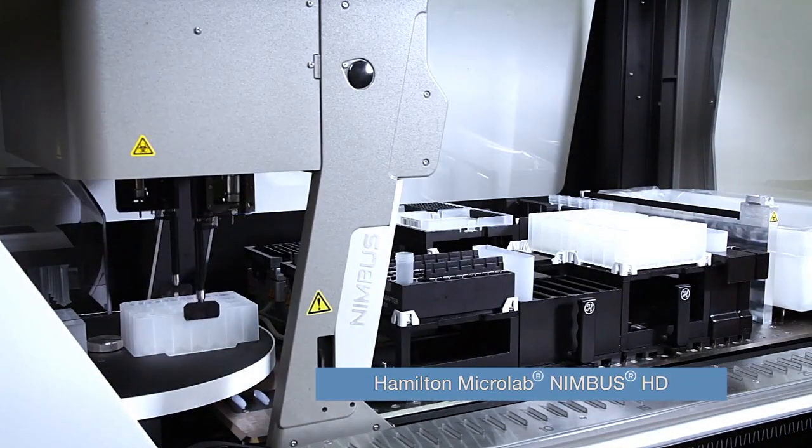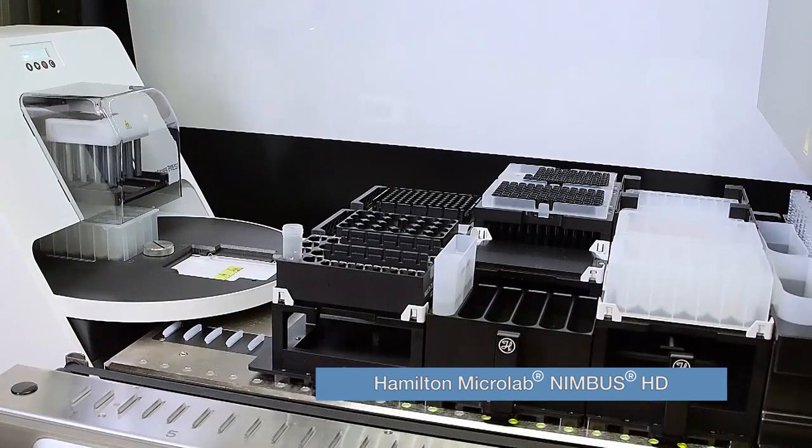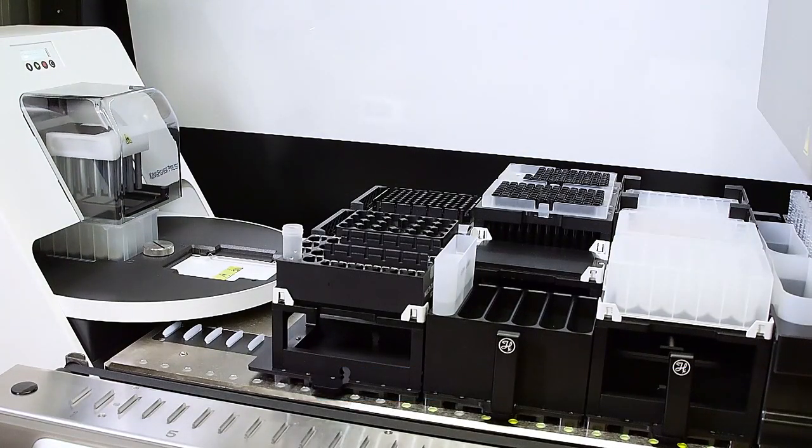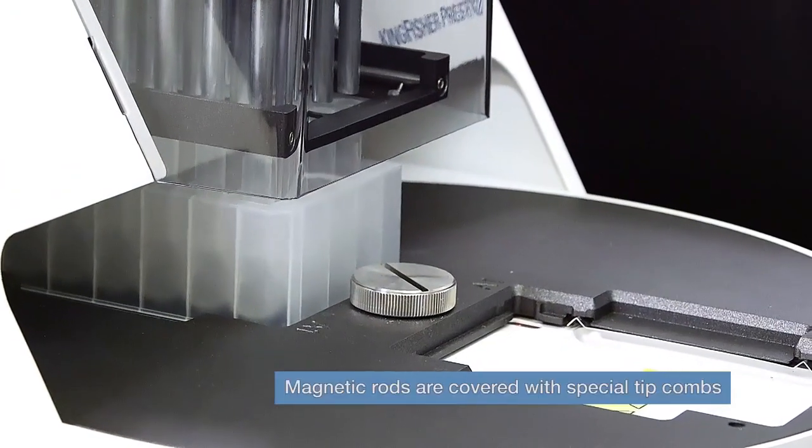Using the Hamilton Microlab Nimbus HD as an example, watch as the Kingfisher Presto and built-in turntable with two plate positions fit easily into an automated system.